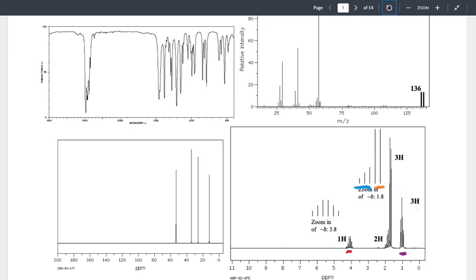Kind of, sort of? So now when we go through and look at that 3H signal, our purple one, and we look real carefully for the white space, we're seeing a white space that would go all the way out. We're seeing a white space that would go all the way out. That's 2 white spaces. The only scenario that I get 2 white spaces is where I have 3 peaks. Make sense? Cool.